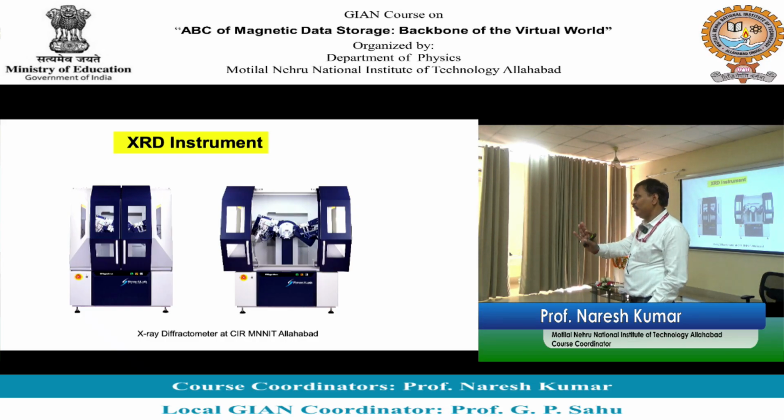Please follow these. यदि आप देख रहे हैं इलेक्ट्रिक इंस्ट्रूमेंट में तो थोड़ा सेफ्टी को देखिए, कुछ भी तार मत पकड़ लीजिए, है ना. तो ये चीज़ें, they are very simple things, but please.